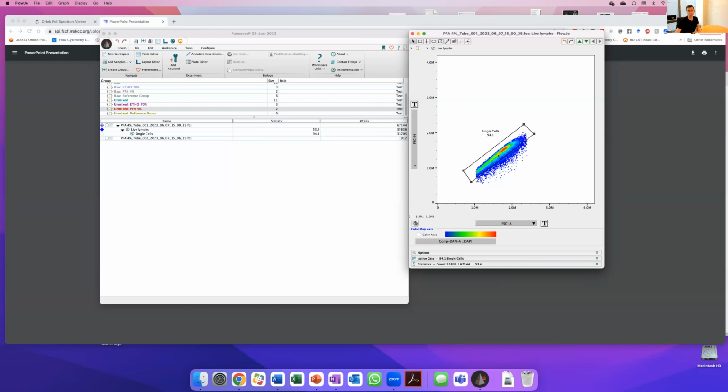It's always difficult. This is the most subjective plot, I usually say, in flow cytometry. It's always difficult to know when the singlets end and the doublets or the aggregates start. And so here's really a subjective call. If you want to really make sure that you have singlets, I would say be more strict, because the more of these that you gate on, the more false positives, let's say, you'll get. So double clicking here, we can continue the analysis.